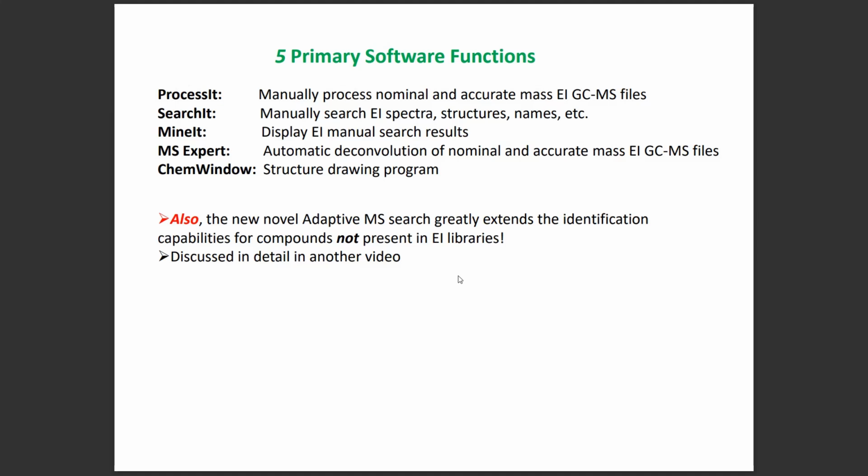Also, the new software contains the very novel adaptive MS search, which greatly extends identification capabilities for compounds not present in the EI libraries. This capability will be discussed in detail in another video. But now let's go to the KnowItAll software.